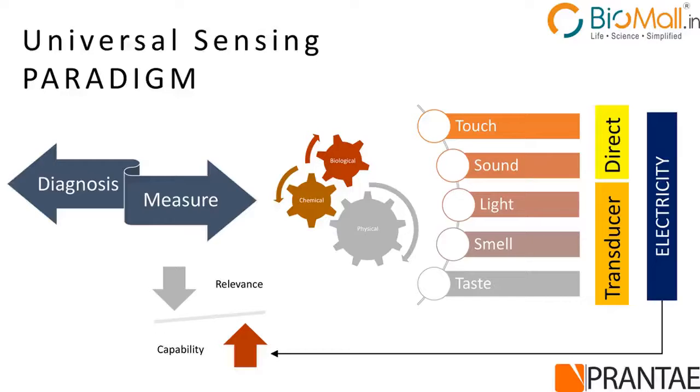Of course, high-end technologies like mass spectrometry and a few sensors, VOC sensors, do something similar to smell and taste, but they are not so good. So most often you rely on touch sensors, which means you are capable of measuring pressure of some kind. A typical example of that is a weighing balance. It measures the pressure exerted by an object that is put over the device, and that pressure gets converted into a signal that you measure, and that correlates with the weight of the object.